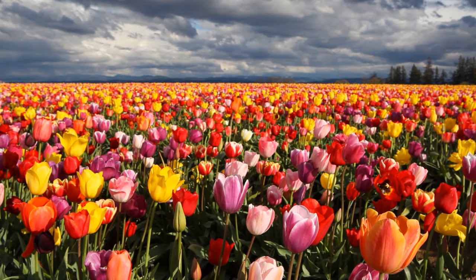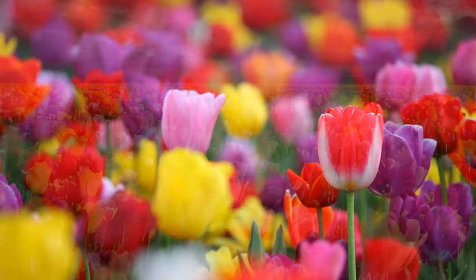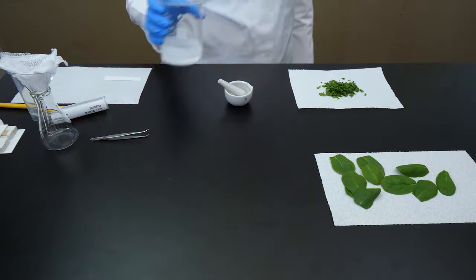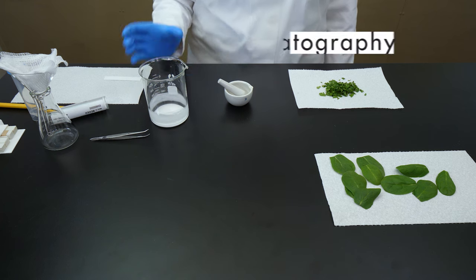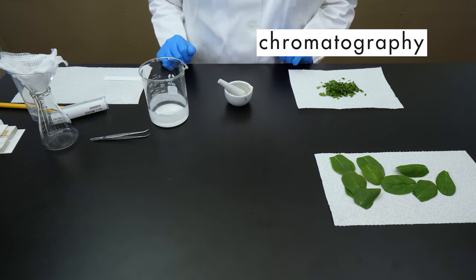To take advantage of all the colors of the spectrum, plants use chlorophyll A, chlorophyll B, and carotenoids. We will use a process known as thin-layer chromatography to separate the mixture of pigments in a green leaf.